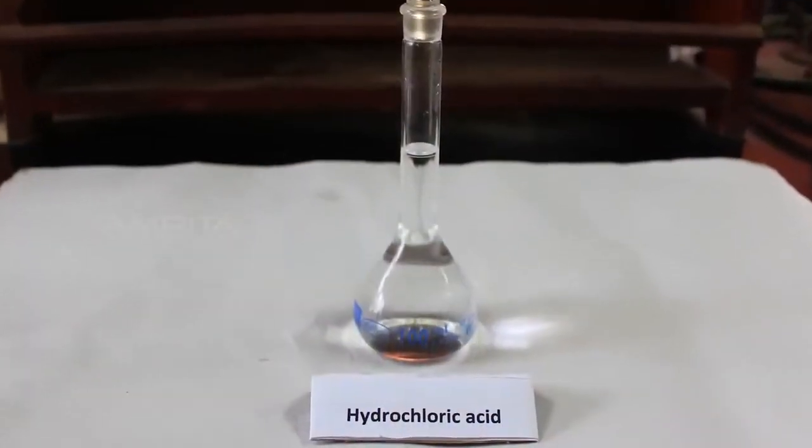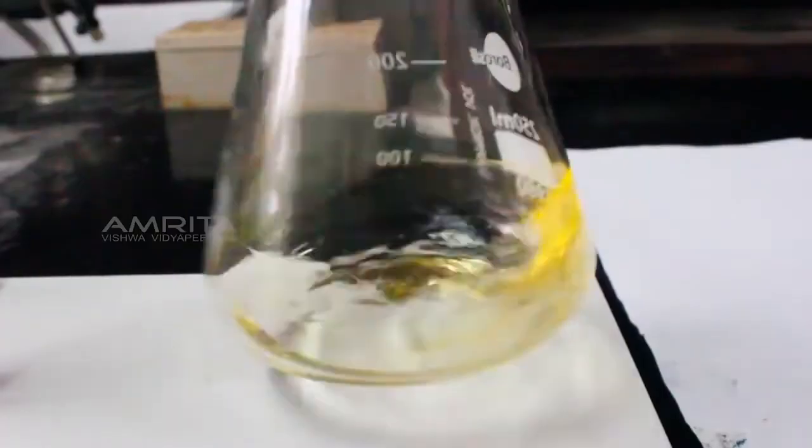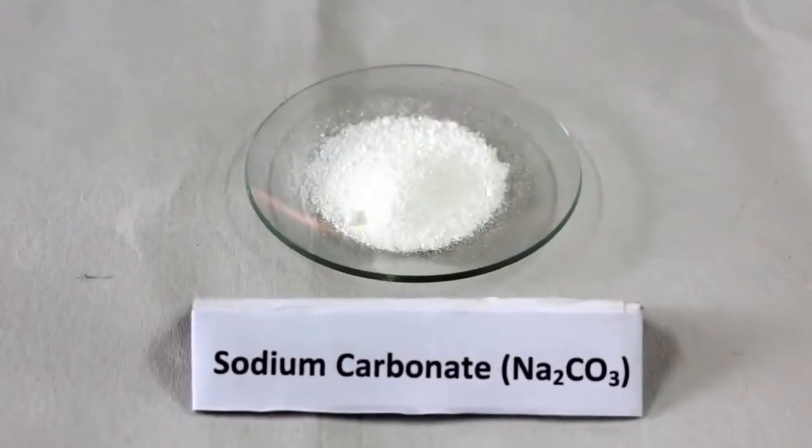Here, we determine the strength of hydrochloric acid by titrating it against a standard solution of sodium carbonate.